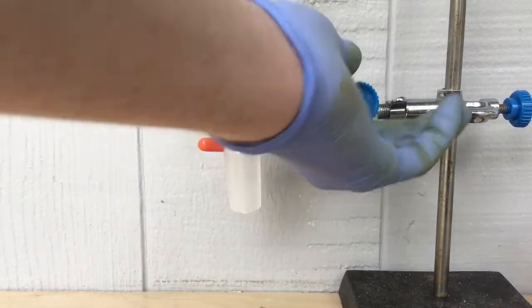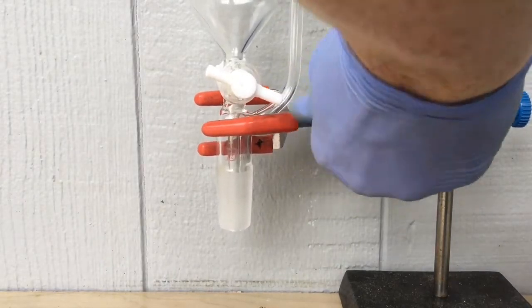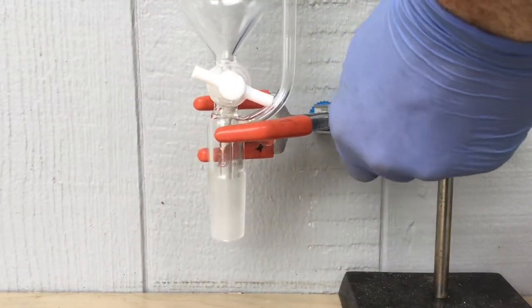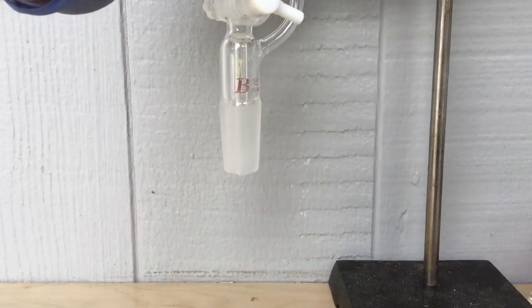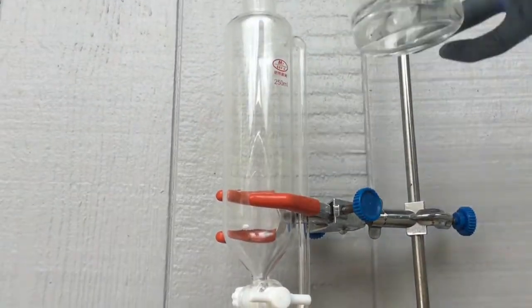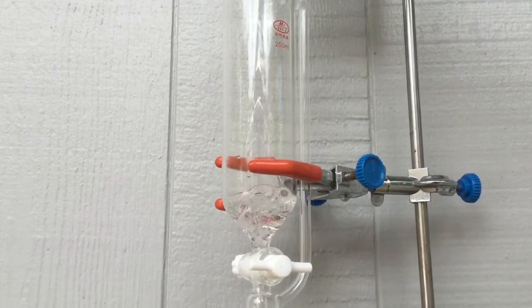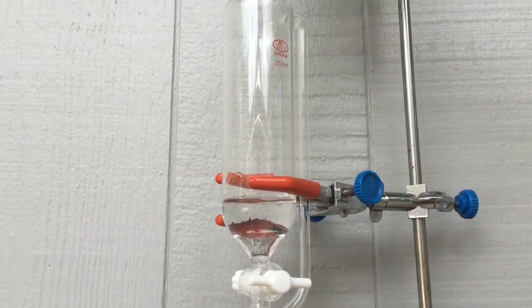Here I'm also setting up an addition funnel because I don't have a proper burette to carry out this titration, but whatever, we can make do with that. Now I'm adding the one molar sodium hydroxide solution and I begin dripping it into our sulfuric acid solution.